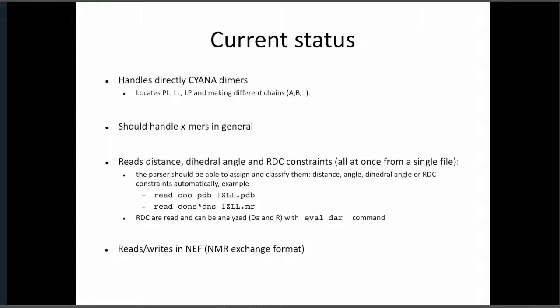You will issue a command, NOE complete, and it will calculate, with a series of defaults, the percentage of completeness between whatever is in the constraints and whatever can be deduced from the coordinates. I believe that is really good sometimes to see the degree to which the NMR experiments provided you with the constraints.